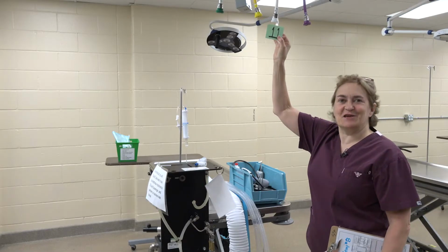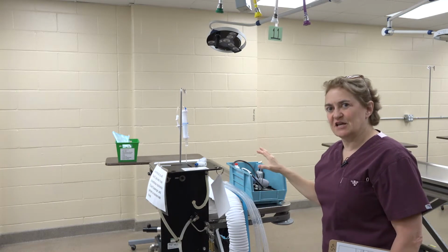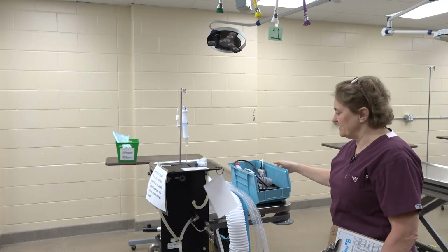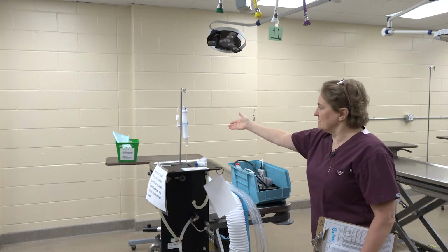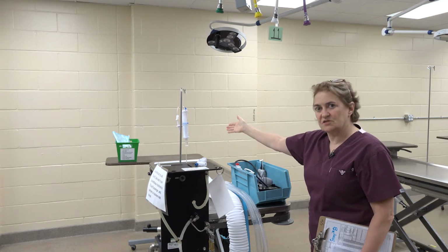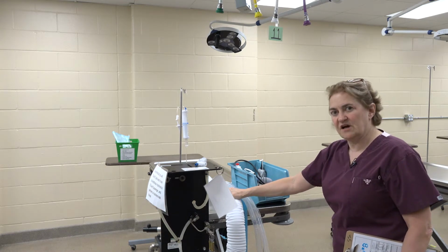Okay, here we are at table 11. So all the supplies we need for surgery are on this table, table 11. So in this blue box labeled table 11 is monitoring equipment. The green box is also labeled table 11. There's a list of supplies there. Those are also things that you need at your table. And your bed jet will be labeled table 11.